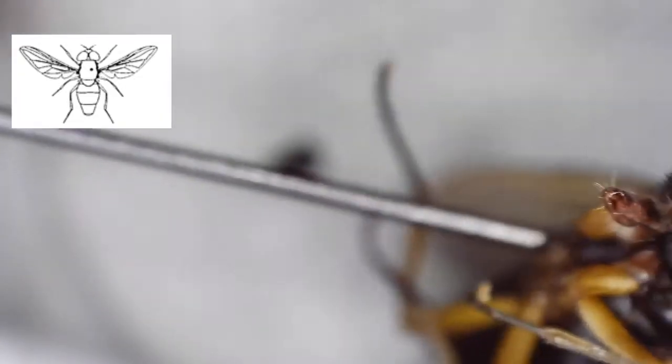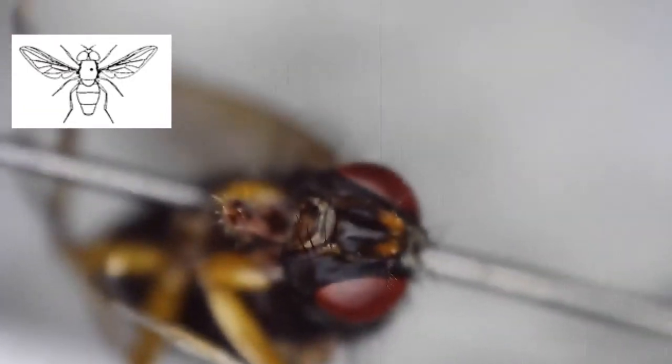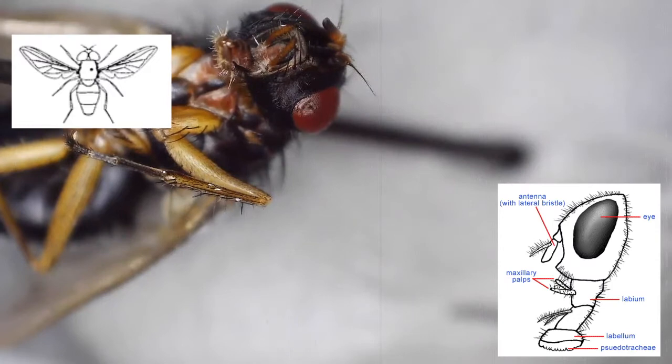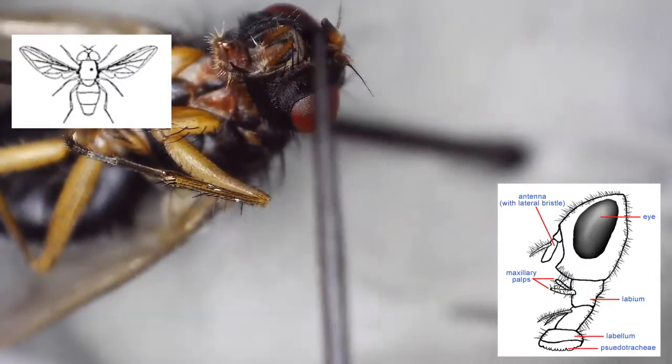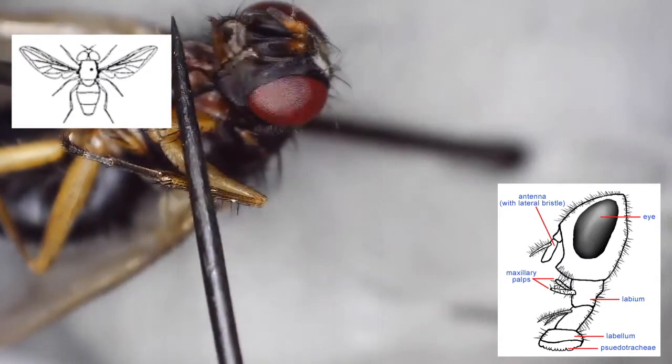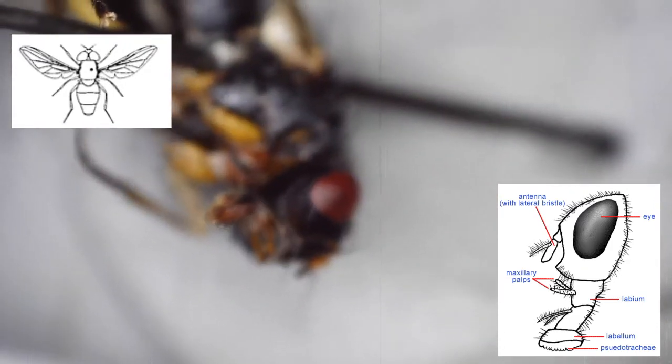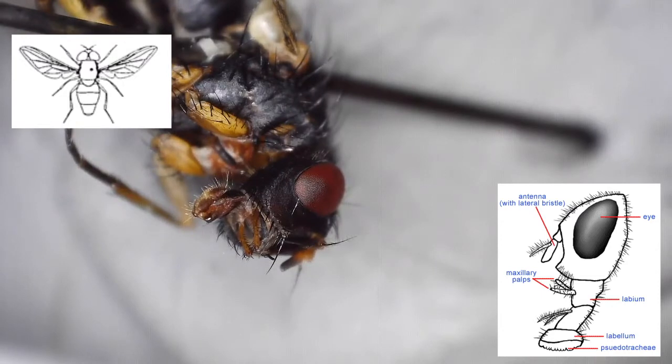Another way that you could tell that this is a fly and not some other order of insect is by looking at the mouth parts. Unlike beetles and Hymenoptera, which have mandibles, flies have sponging mouth parts. So they're not going to be cutting their food apart, they're going to be lapping and sponging. Some flies are going to have biting, sucking mouth parts like mosquitoes, but they're not going to be the mandibles that you're used to seeing. And what you can see here on this fly that I'm moving around are clearly those sponging mouth parts.